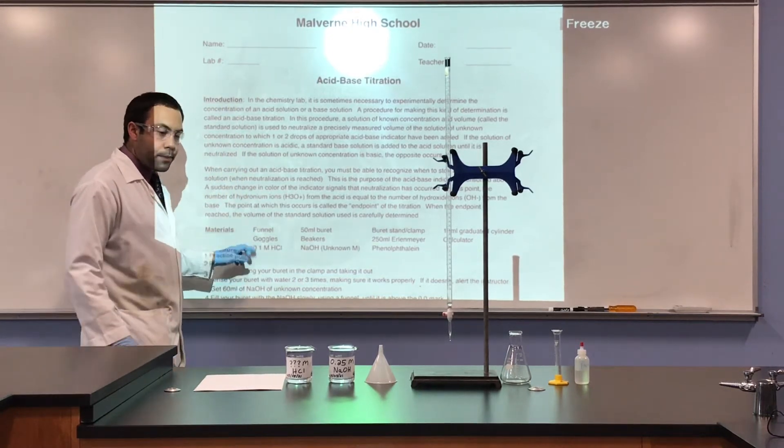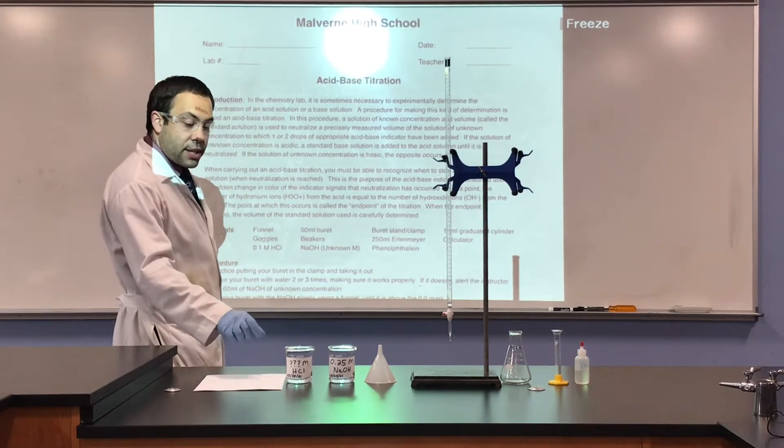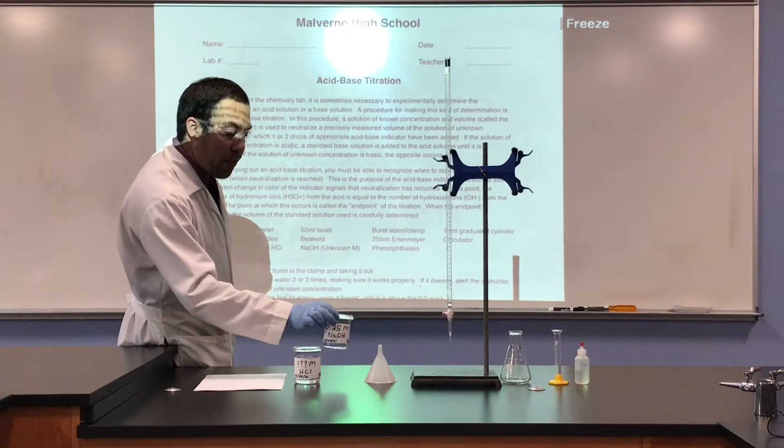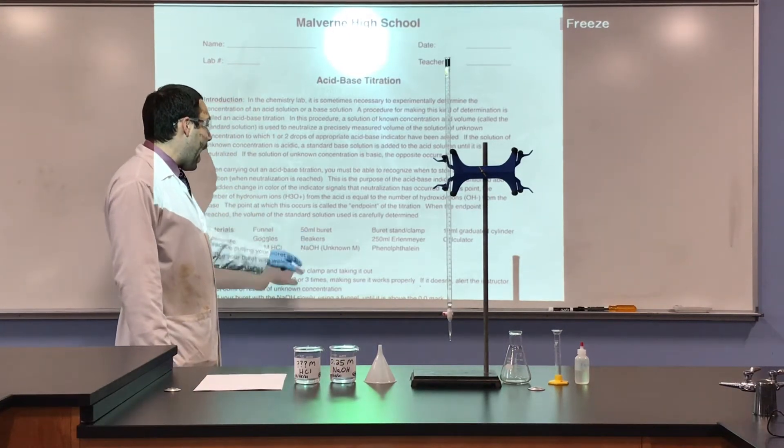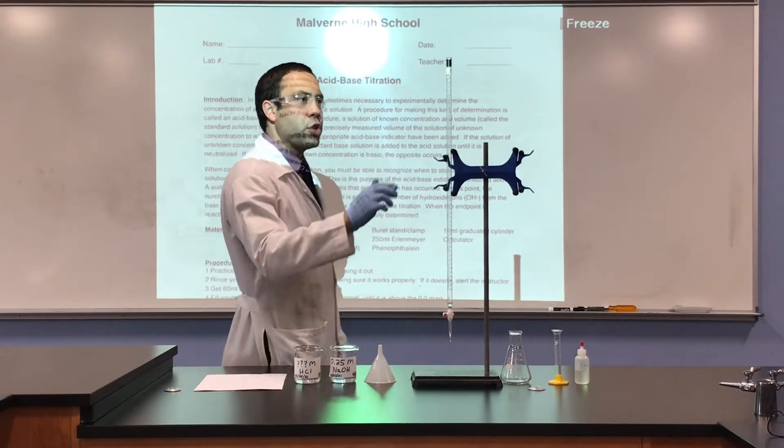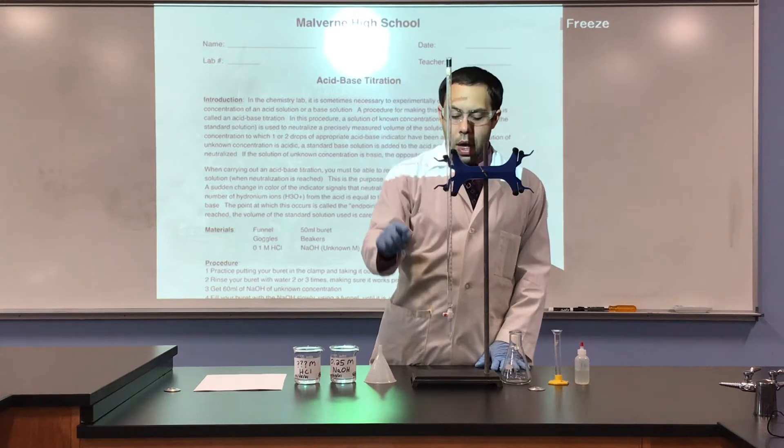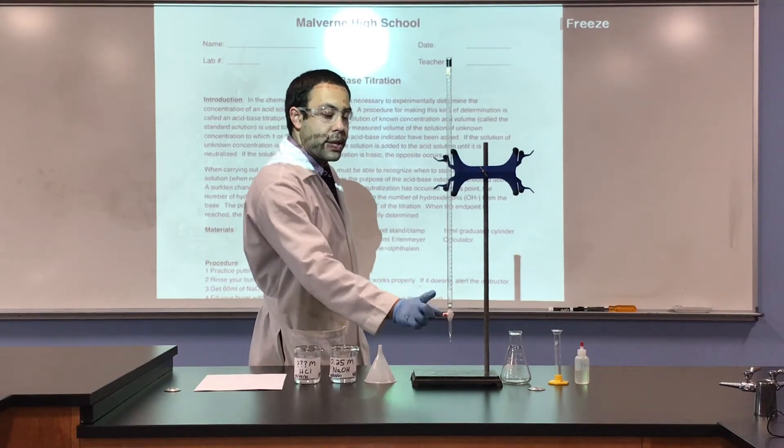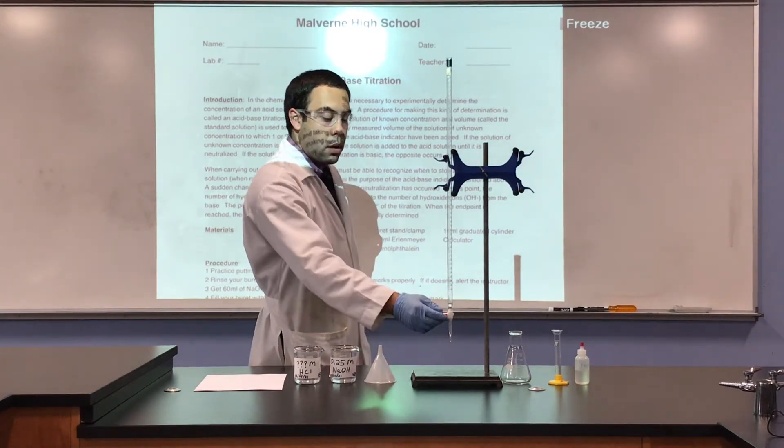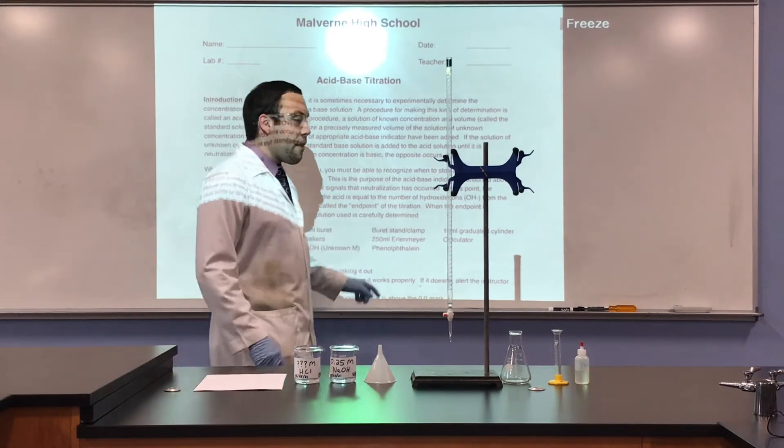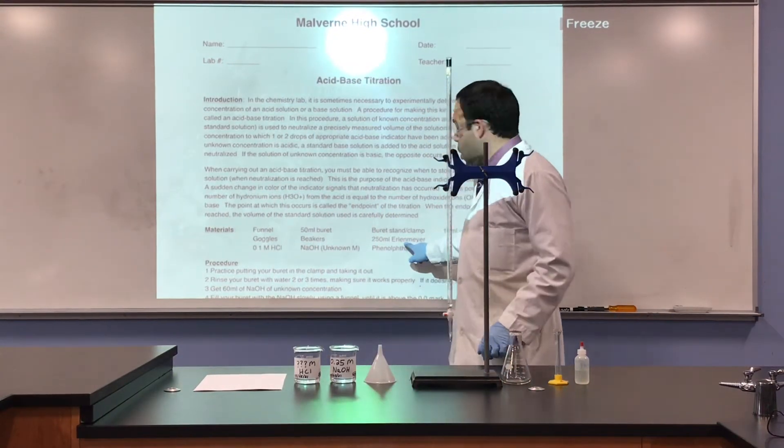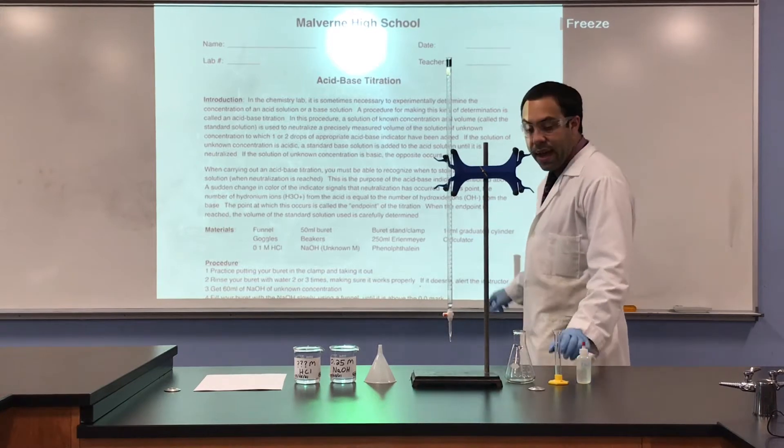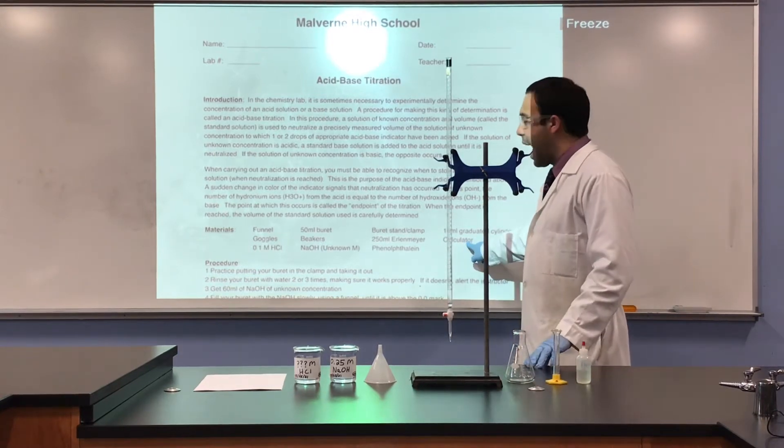So the materials we need: goggles of course, funnel. Today we're going to use an unknown concentration of HCl, hydrochloric acid. And we'll have a known concentration, 0.25 molar NaOH. We have our burette, this long glass tube with graduations. It starts here at 0, and it ends down here at 50. We can see the valve, also known as the stopcock, is off when it is in a perpendicular direction. Perpendicular it is closed, and parallel is open. We have the burette stand and clamp, an Erlenmeyer flask, phenolphthalein our acid-base indicator, a 10-milliliter graduated cylinder for our acid, and we will also use a calculator.